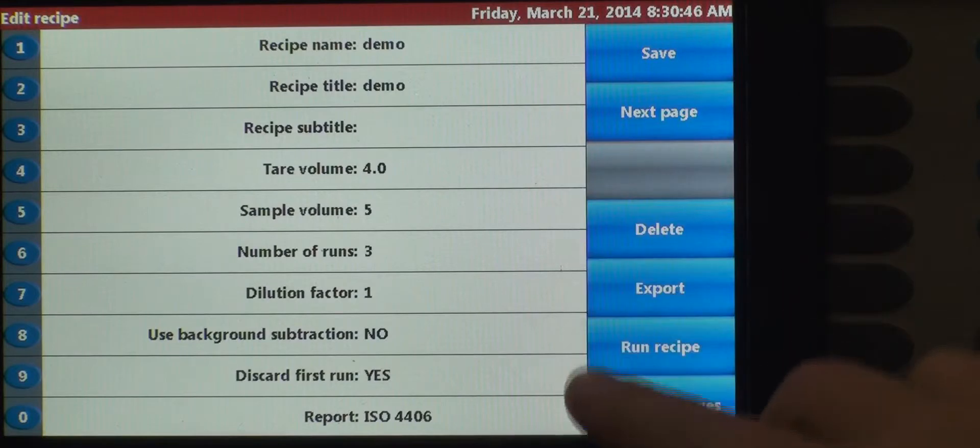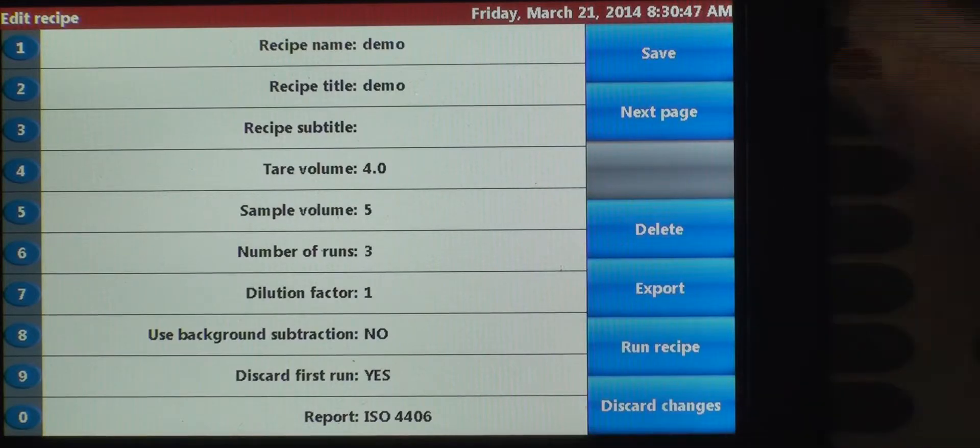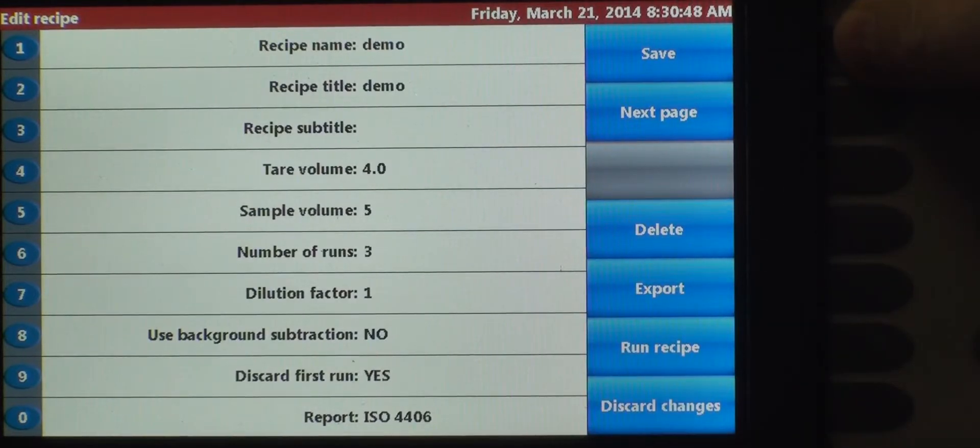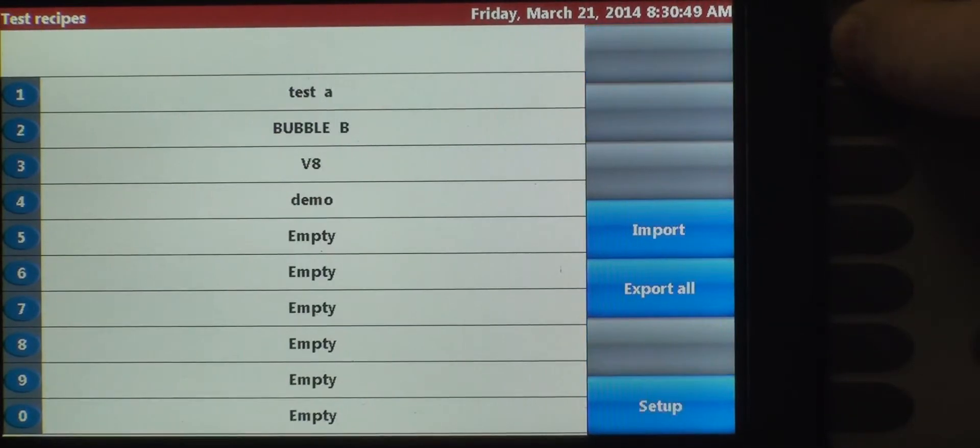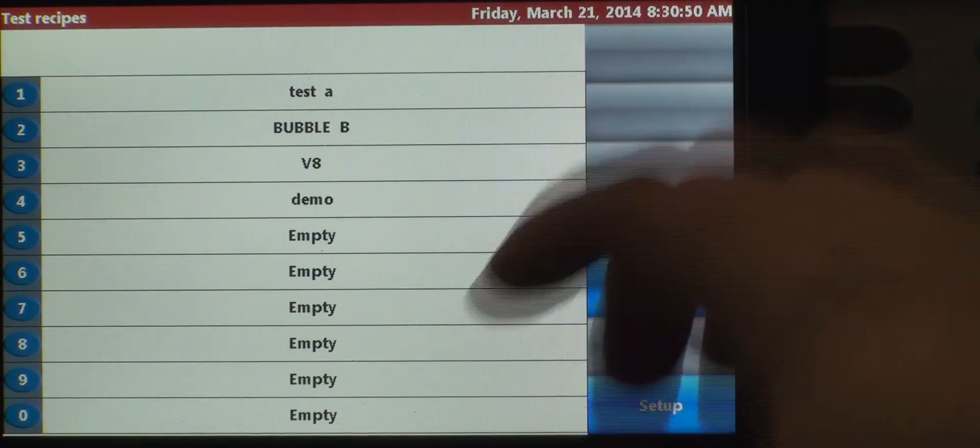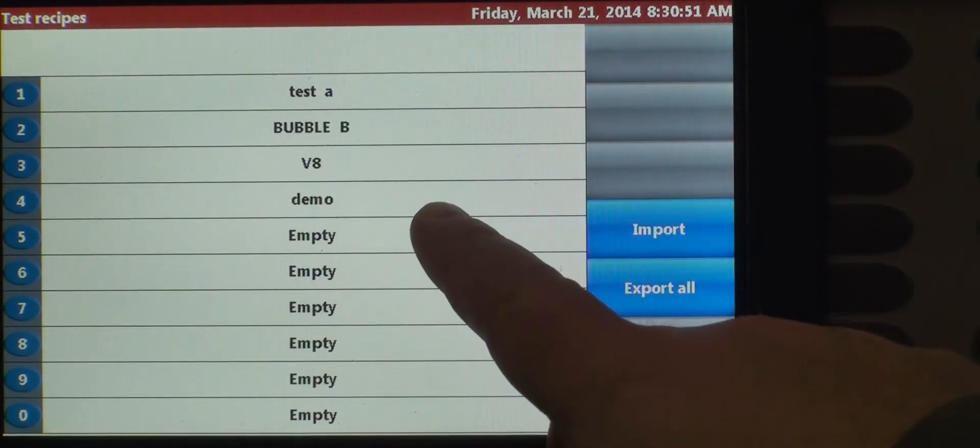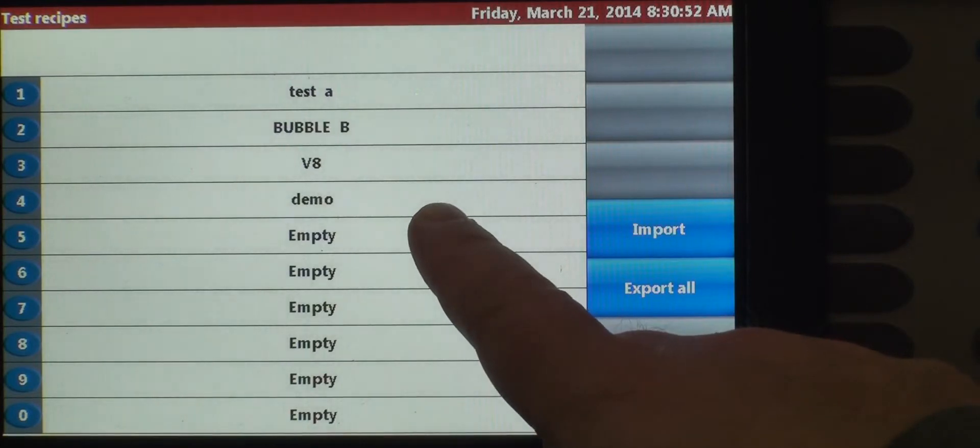We've got everything set up, and we're going to save it. So now we see number four is our demo.